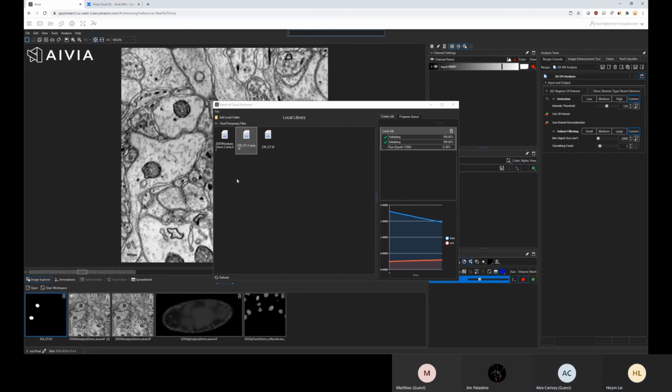So I'm playing with microtubules. Since they're pretty much a 1D structure, stretching over a single dimension, maybe there won't be a big difference between 2D versus 3D. Yeah, I don't think there will be much difference for sure. But maybe for some other objects. Yeah, the one thing to be wary of, especially for the ground truth, is that if you're planning to do deconvolution, make sure that the deconvolution doesn't get too aggressive when it comes to suppressing the information around the edge of the microtubule.